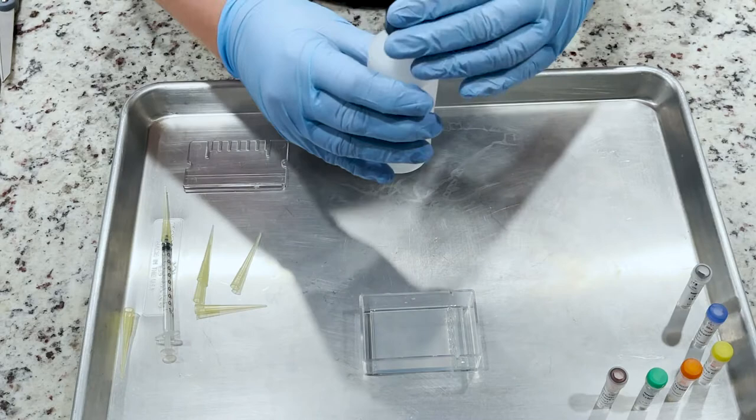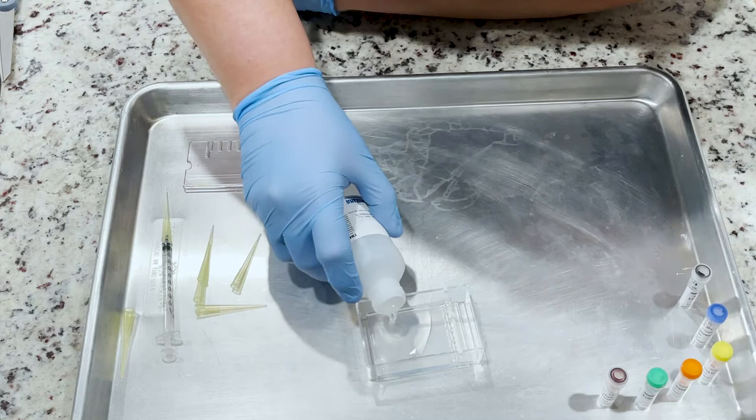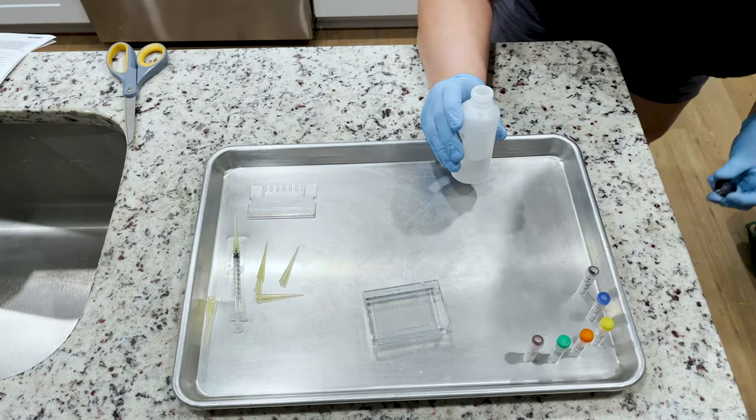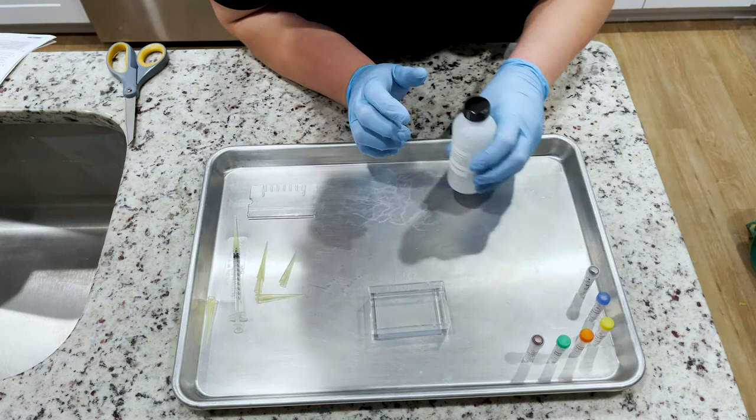Next, you want to take the buffer and pour it over the gel. You want to make sure that the buffer goes into those wells on the end that did not have the gel inside them. It should completely cover the gel, and I go a little bit over the gel maybe by a couple of millimeters.